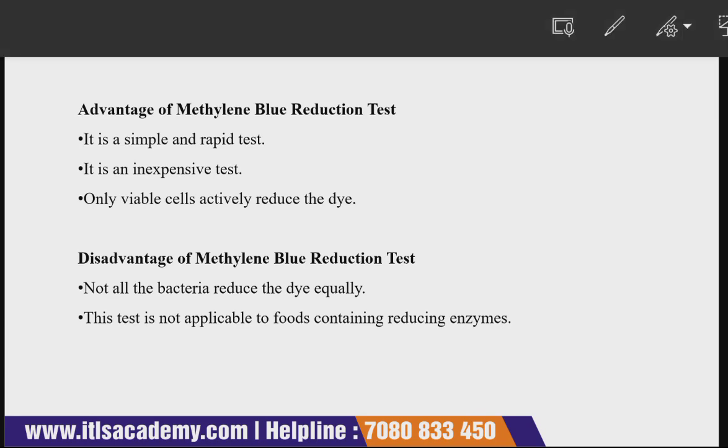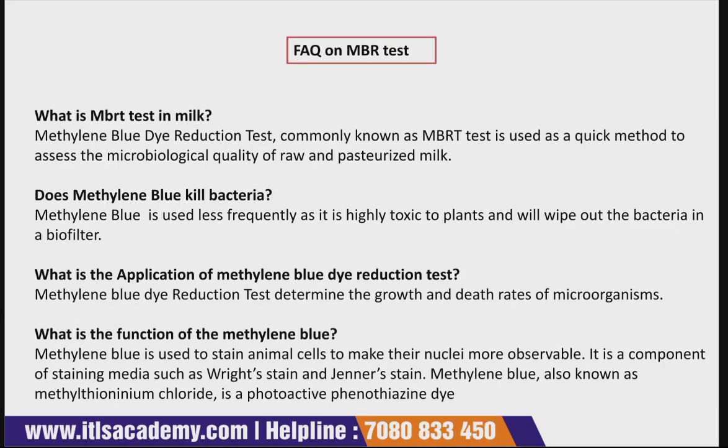Now, moving further to some frequently asked questions in interviews as well as in examinations. Before that, let us talk about the conclusion of today's experiment. The conclusion is that the methylene blue reduction test gave an accurate result about the quality of the milk and the amount of contaminants, or you can say microorganisms, present in the milk.